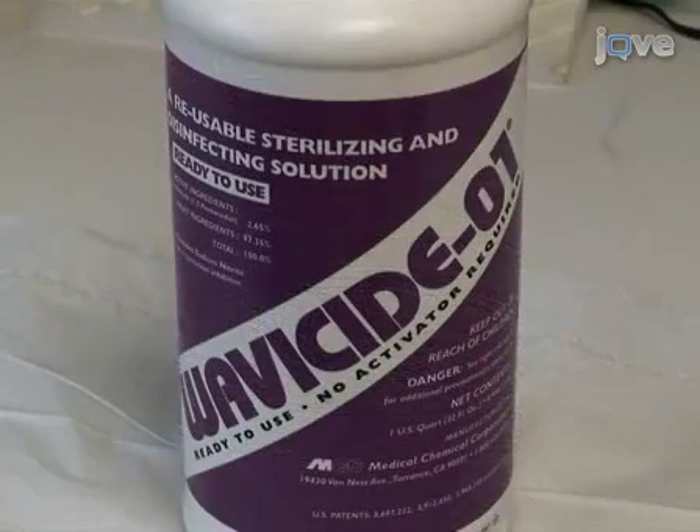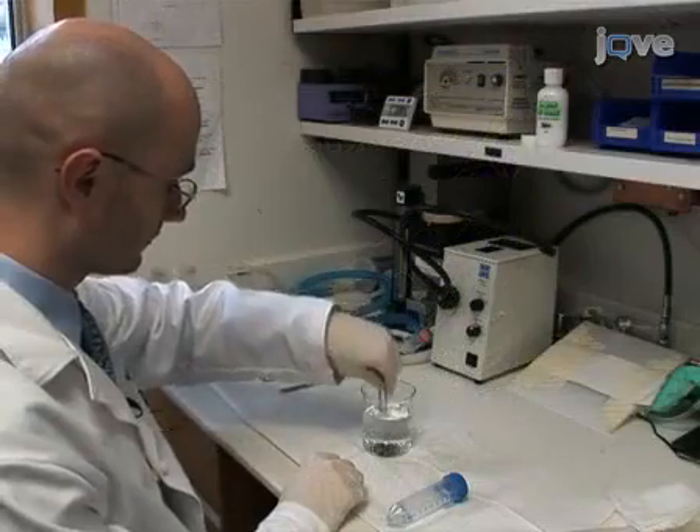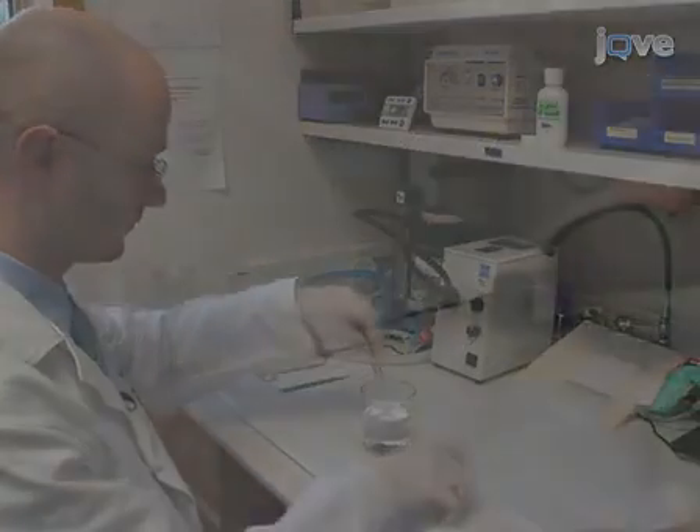Additionally, use Wavicide-01 disinfectant overnight to sterilize the ECG telemeter. Be sure to wash the disinfectant off with sterile water before implantation into mice. Check the telemeter leads for integrity of both the insulating sheath and exposed wire.